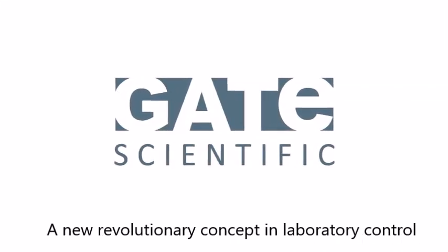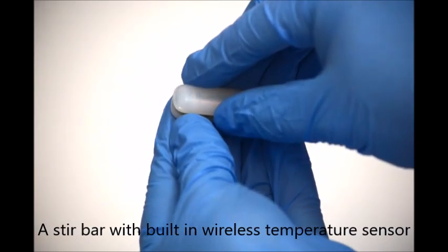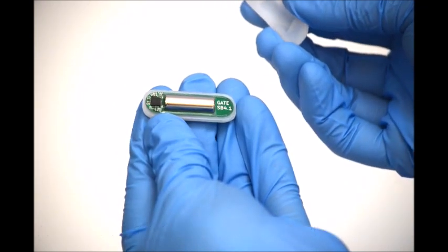We are so proud to introduce the first ever wireless stir bar. It has a wireless temperature sensor built into the stir bar that will measure the temperature of the liquid.